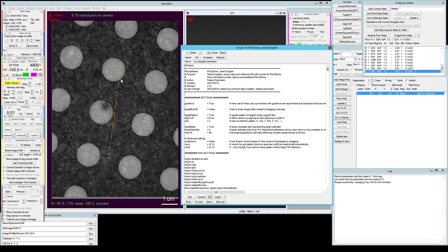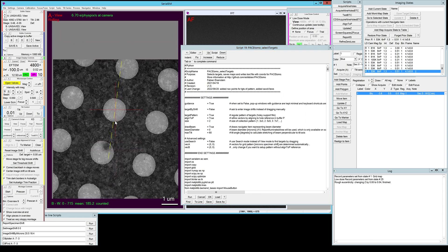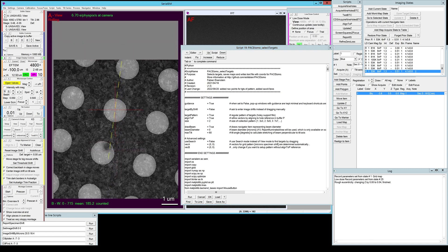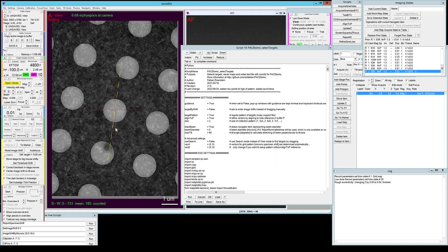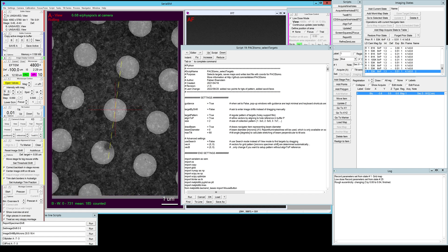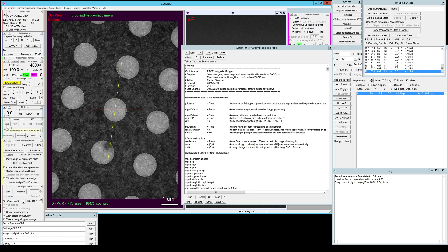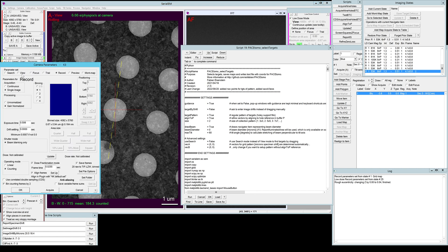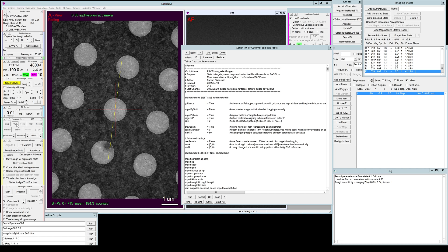Before we start running the script we should define the hole reference. This hole here looks nice and clean so let's center it. For a hole reference it's important that you only have one full hole in the field of view. So what we're actually gonna do is go to setup and we're gonna set it to half and square to restrict the field of view of our view images.